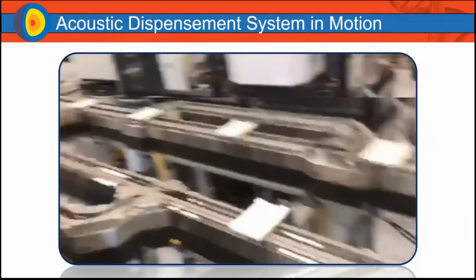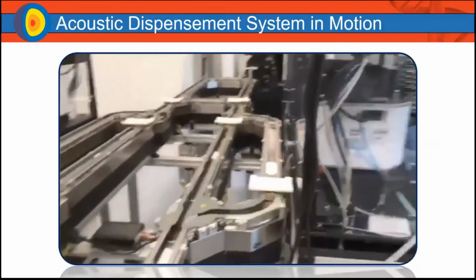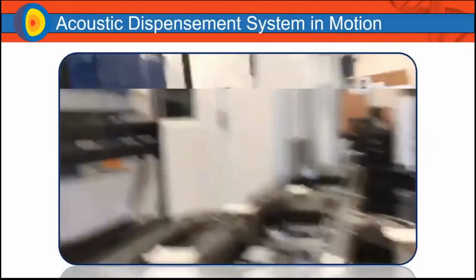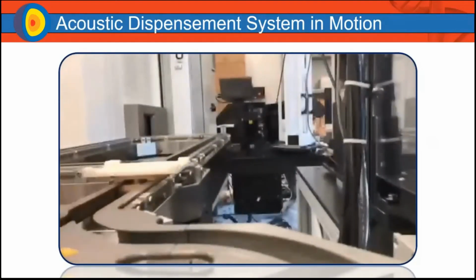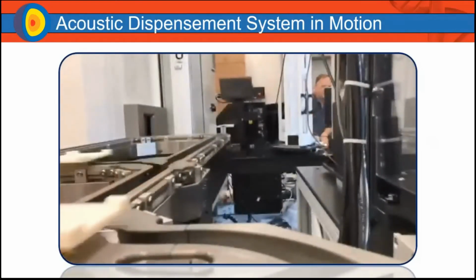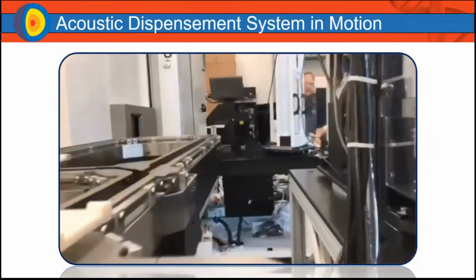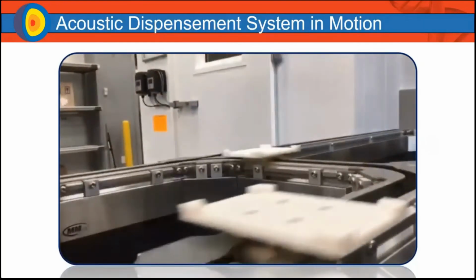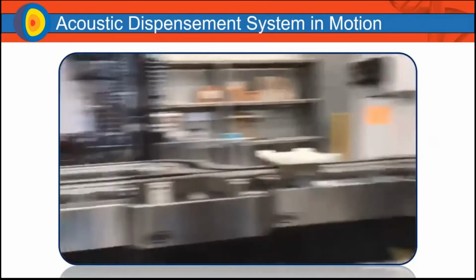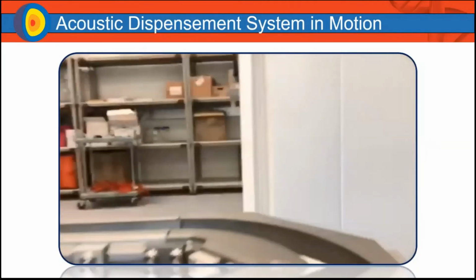So I want to briefly showcase what this system looks like physically, and give you an idea of how we've leveraged the same architecture, where we have the concept of highways and spurs. What you're seeing here is a GoPro that's been put onto one of the vehicles, so this is simulating what it looks like for the plates. You'll get to take a ride here on the track system, and one of the things you'll notice is we're going to the Verso store.